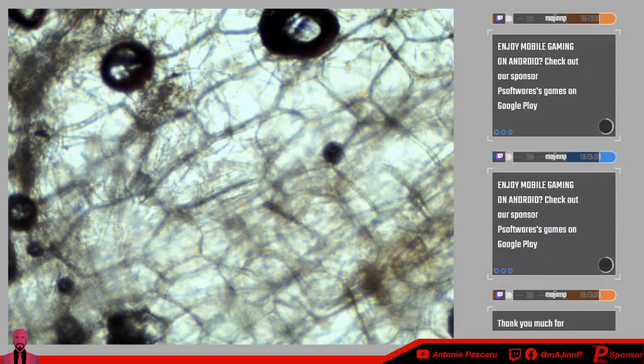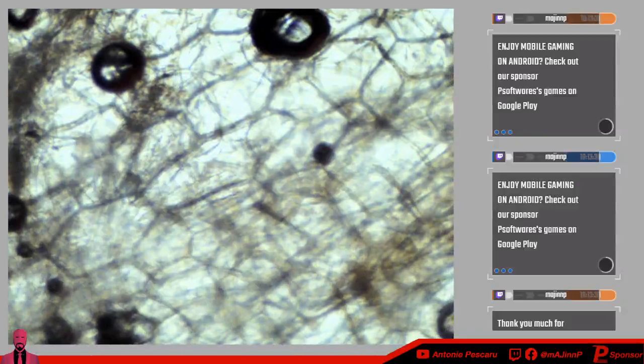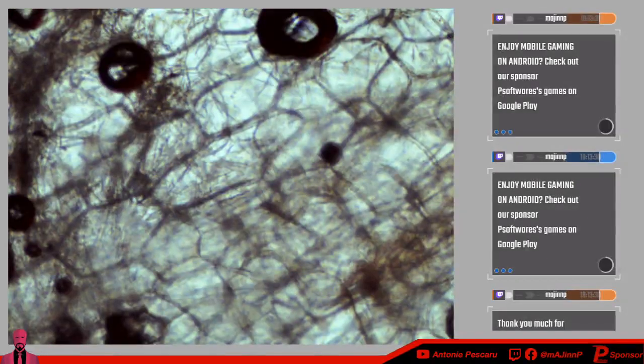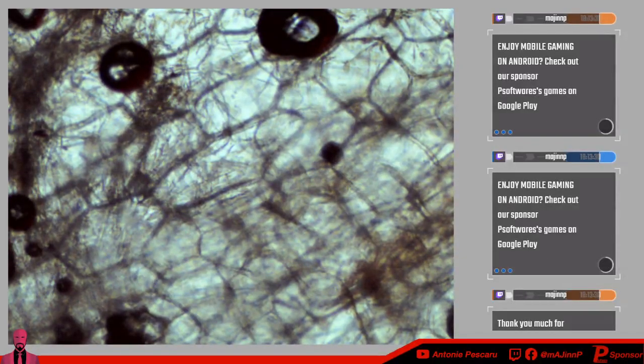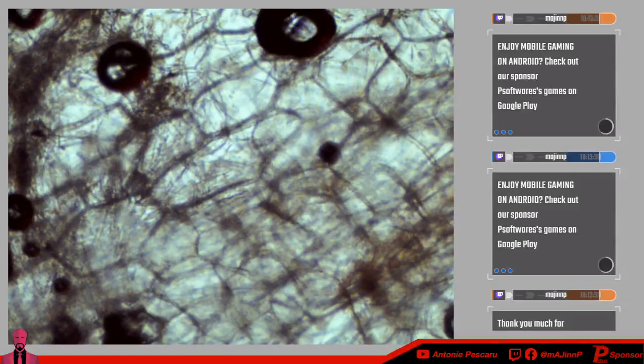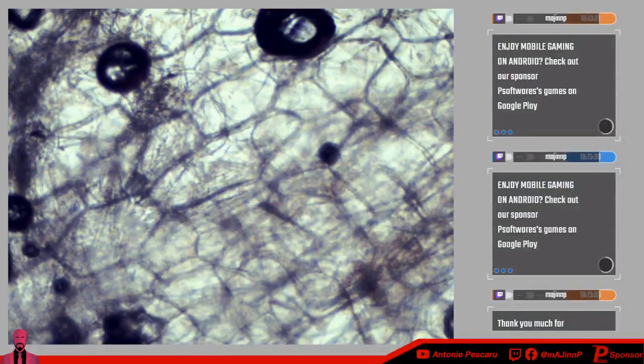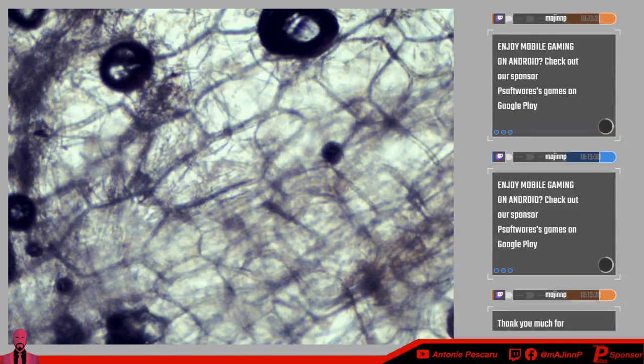But anyways, now that that's done, the only unfortunate thing, I'm going to try to see if I can switch lenses over here. Oh, I swapped it to green, I think. It's really hard to change the apertures to different colors and everything, because it makes the microscope move as well.